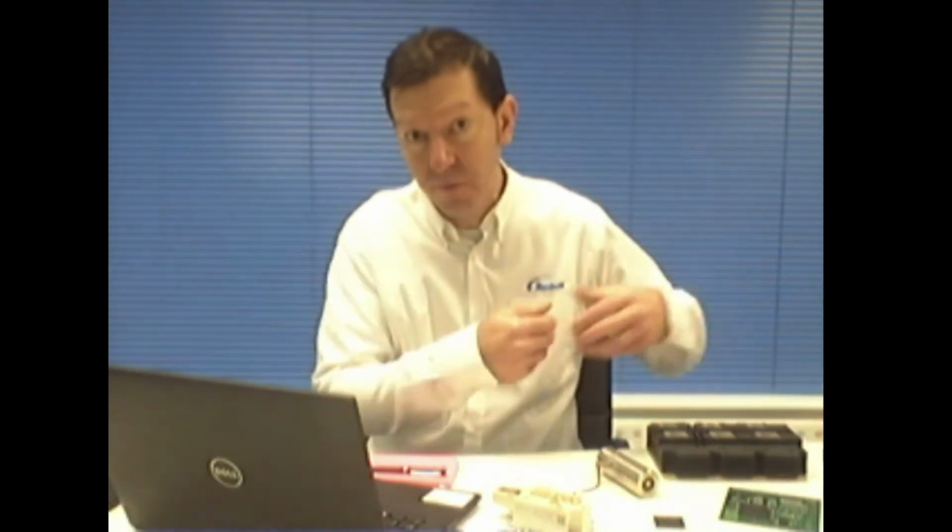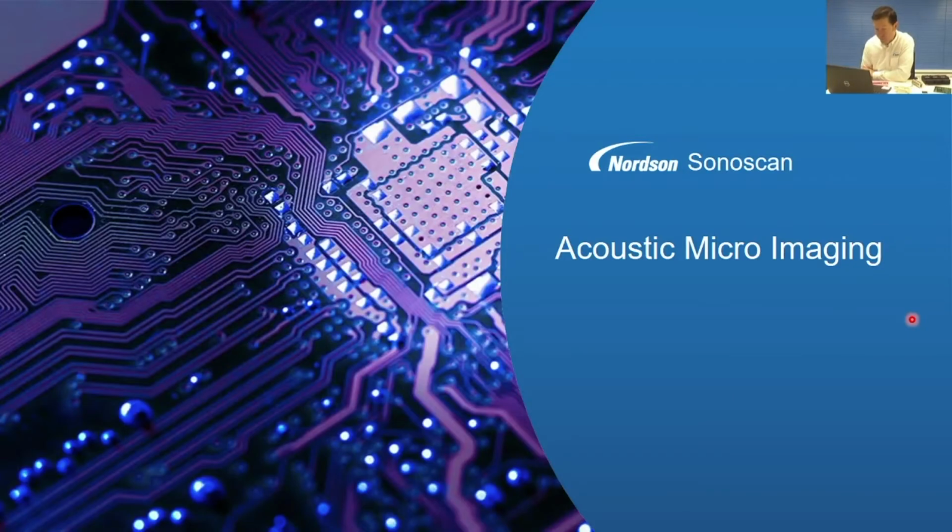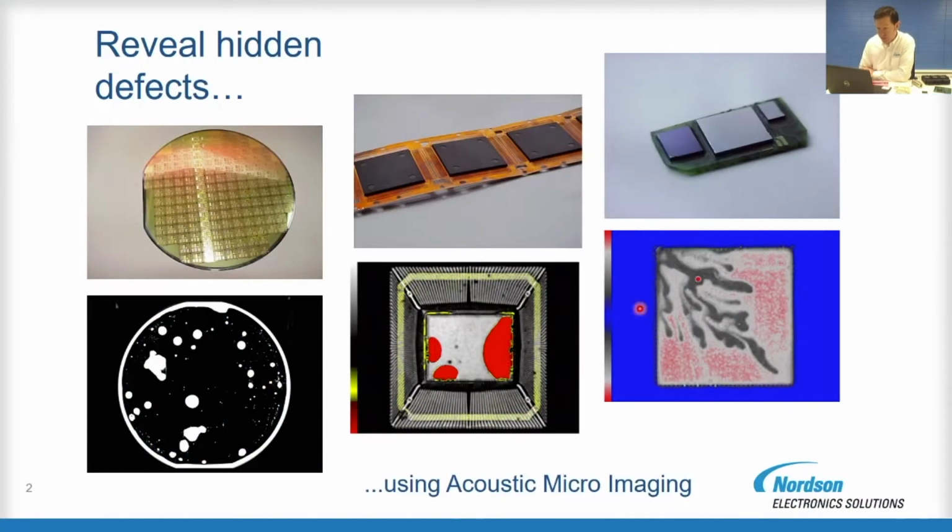So first, I'm going to give you a few slides as an introduction to ultrasound. So let's have a look at that. So the first slide shows us three application types and the type of images that you can expect to get using the Sonoscan system.